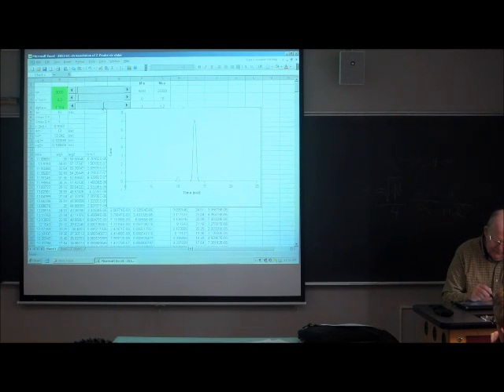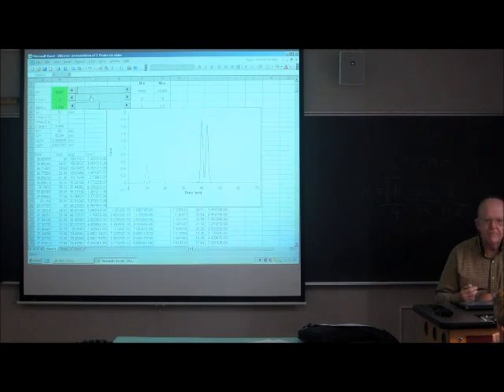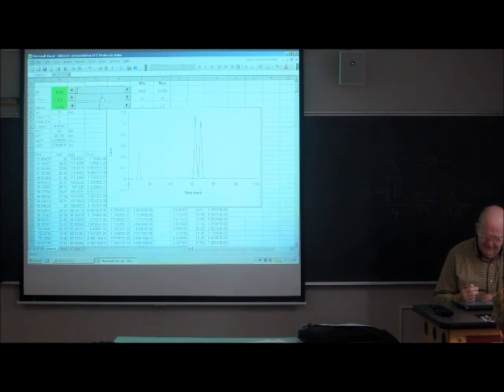Oh, sorry, wrong variable. Let me put this back to where it was. That's perfect. Okay, K prime in fact is 0.3 if I look in the green box. Bam. I increased the K prime of the first peak to 3. Now it's 5.